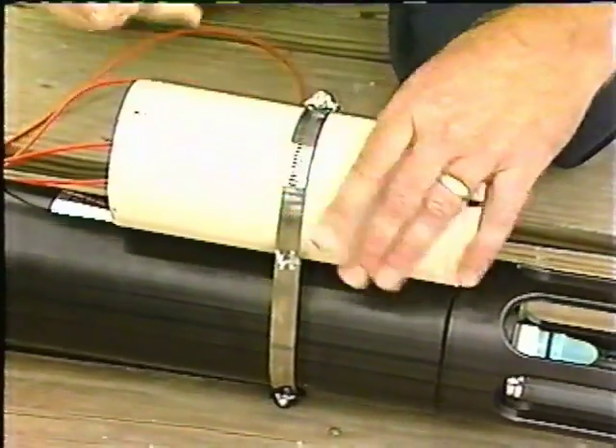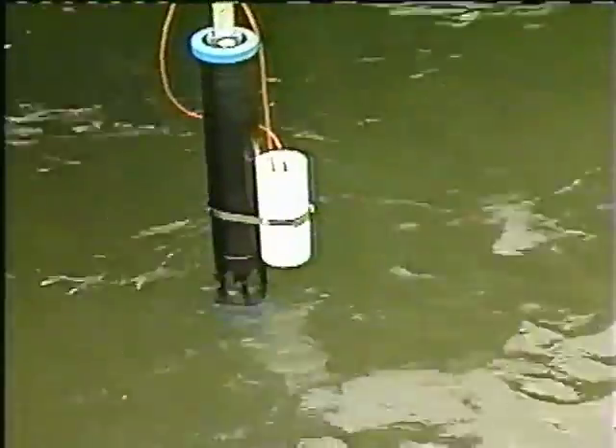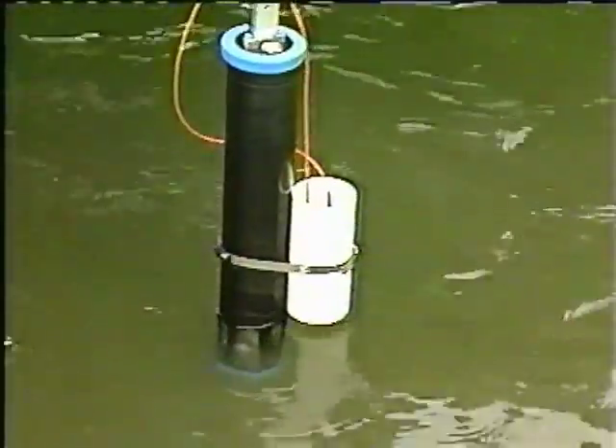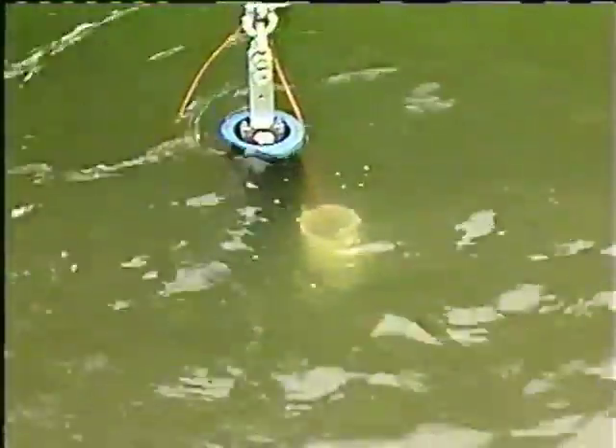The oceans act like a big sponge. If we're lucky, the oceans will absorb all this extra CO2 and we won't have a greenhouse effect. If we're not lucky, they won't be able to keep pace and we will have a greenhouse effect. The real burning issue in oceanography is how fast is this happening. The miniature spectrophotometer can be strapped to other instruments and dropped into oceans all over the world from planes. Radio signals from the devices can be sent to satellites that NASA will launch in 1993, and back to Earth-bound computers — we will then know the timetable for the greenhouse effect and be able to take appropriate actions to stop it.